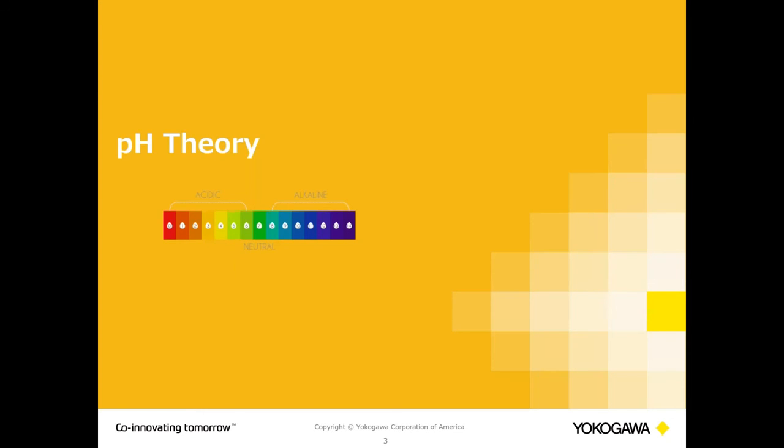All right, so let's dig into the theory a little bit more. Dick said that we measure pH, one of the reasons being to consider corrosion and scaling. Another reason you may be measuring pH in your plant is because there are some applications and chemical reactions that only occur at certain pHs. So you could be using pH not just for water quality, but for other reasons within a plant. Most common is water quality.